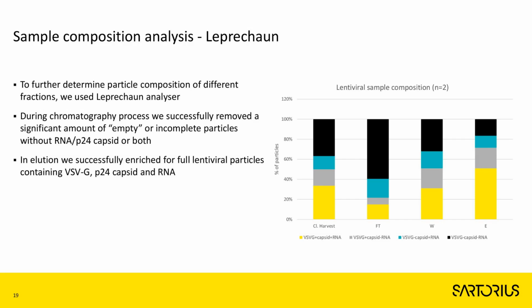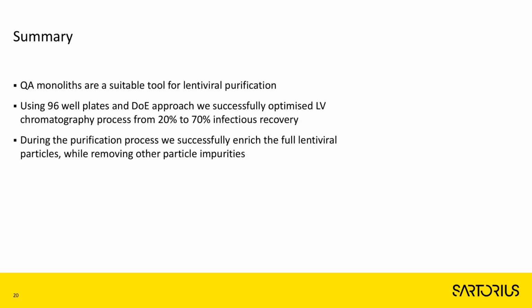So with that, I would like to summarize our conclusions. We have shown that the QA monoliths are a suitable tool for lentiviral purification.